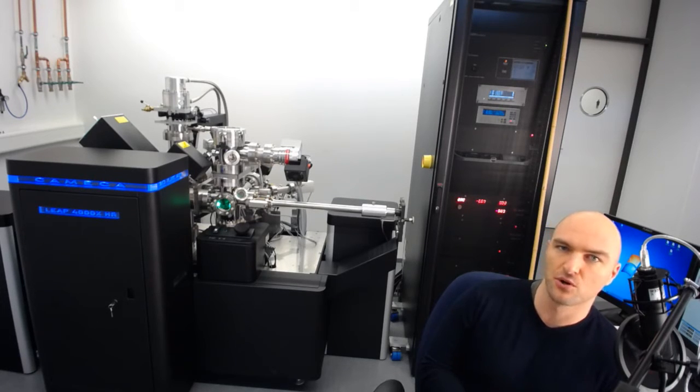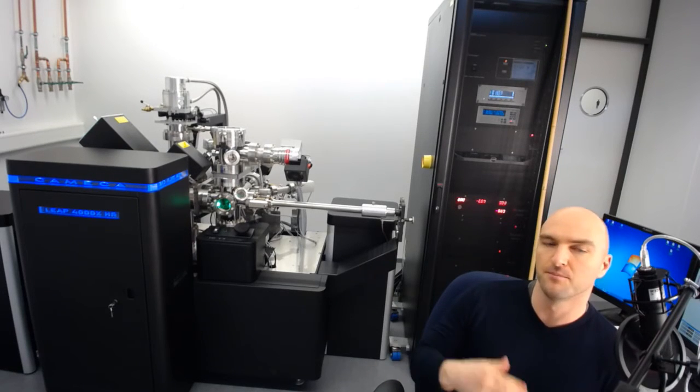This model must be right now the most common Atom Probe out there. From the 4000 series, there's also another model called SI. The difference between the two is beyond this video, but in terms of operation there is no difference. So if you've got a LEAP 4000, it doesn't matter if it has a laser or not, or if it has the HR or the SI detection system — you will be able to operate it much the same way.